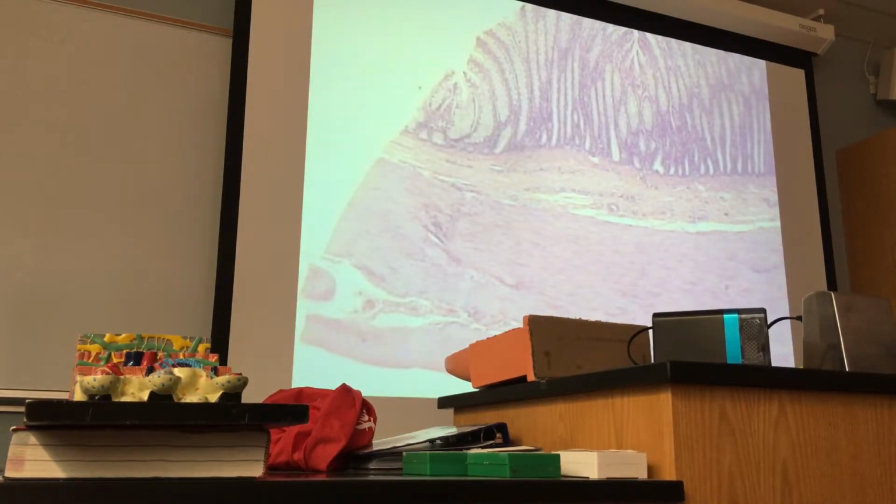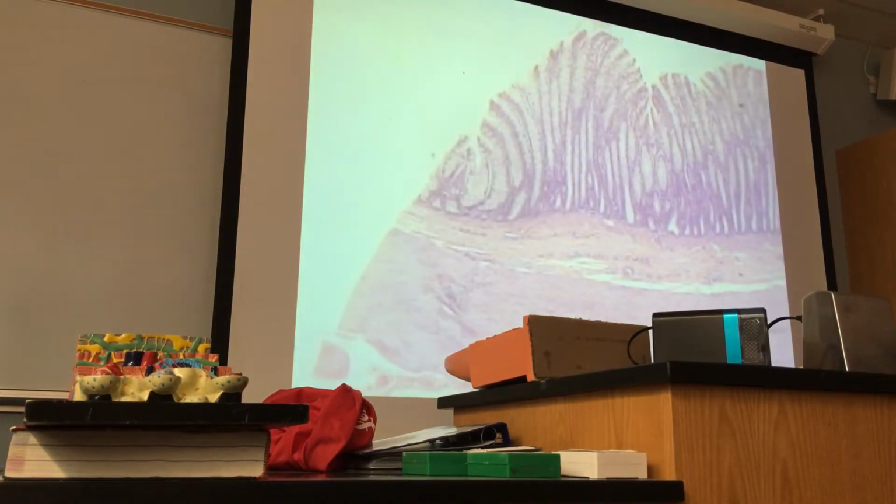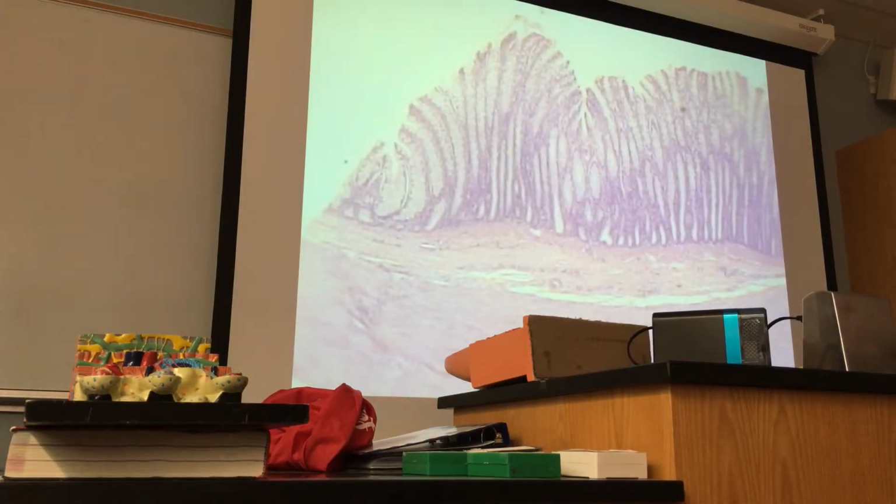And this is the longitudinal muscularis. This is circular muscularis. Here is submucosa. And from here to here, mucosa. The mucous membrane, or I can say that mucosa, does not have villi. This is the large intestinal epithelium forming large intestinal glands. These are glands. These are the openings of the glands, and this is the lumen of large intestine.